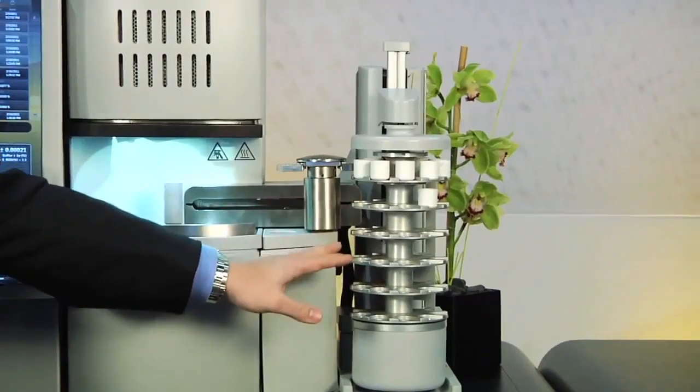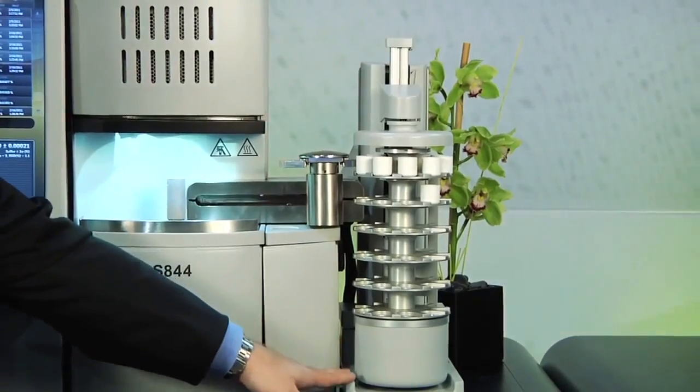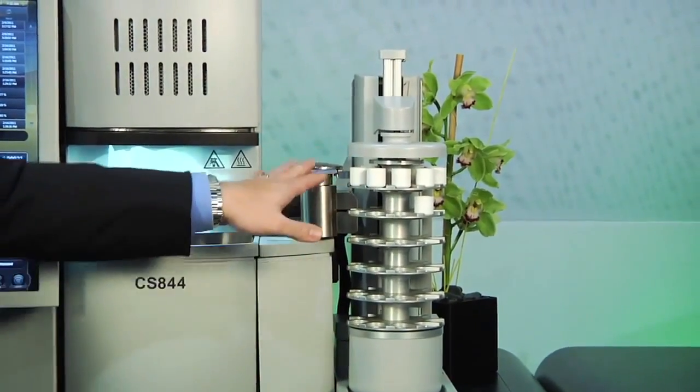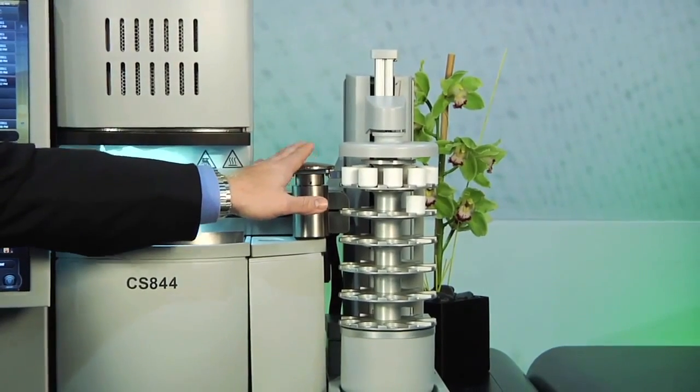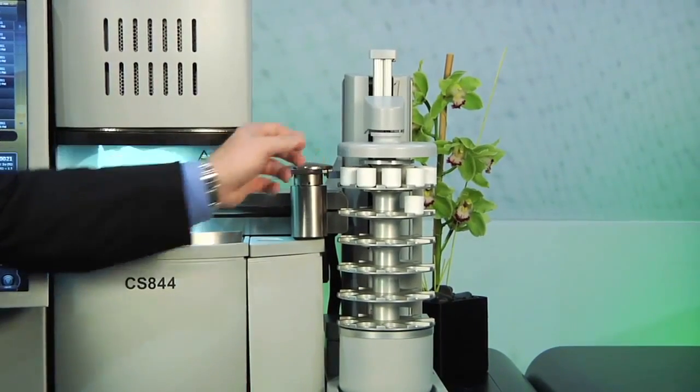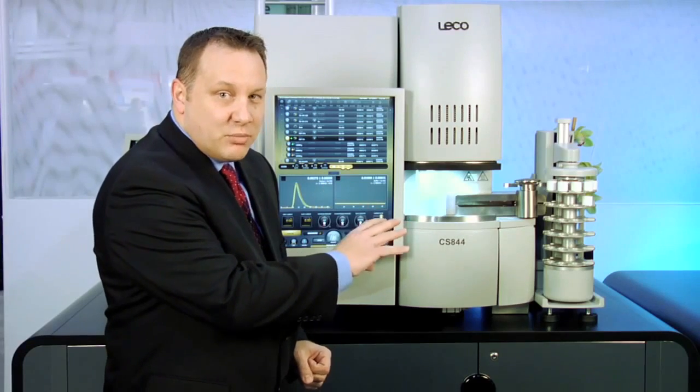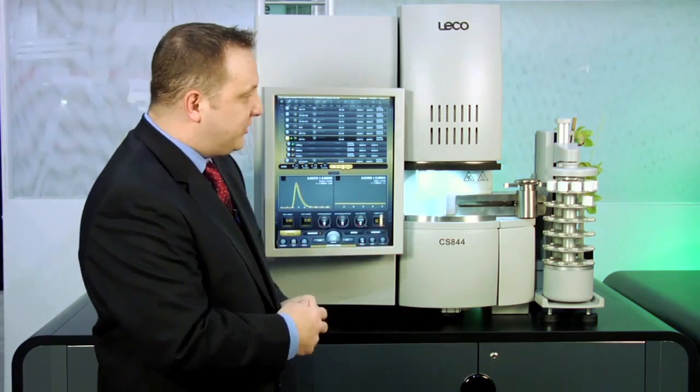The system utilizes six 10 position carousels on a vertical assembly that will raise and lower those carousels so that the shuttle grippers can pick them and place them on the crucible. The key to this system is the simplicity in design and the lack of complex movements.